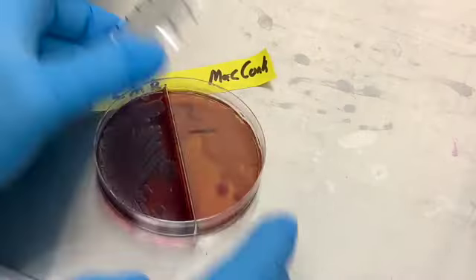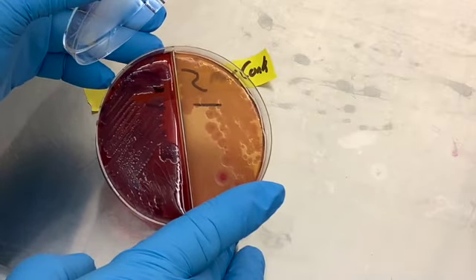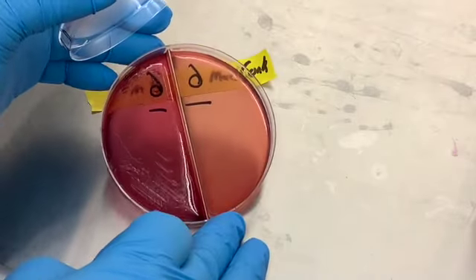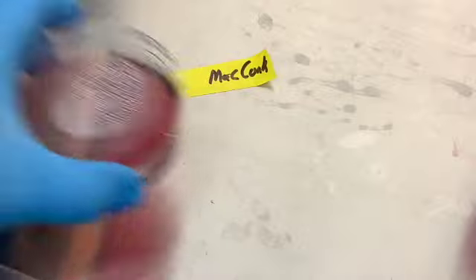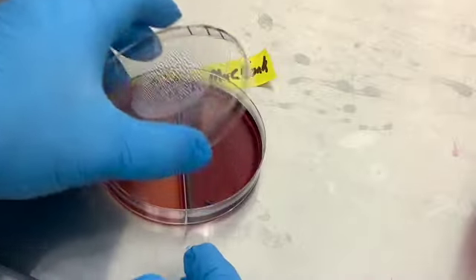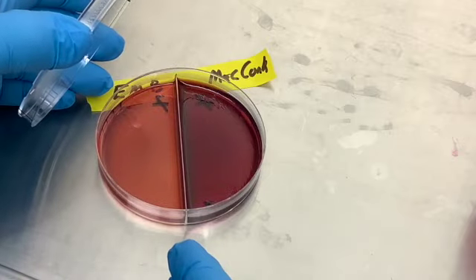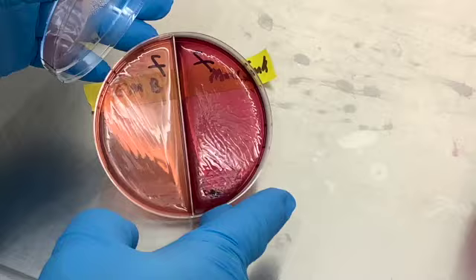Number 5. Number 6. No growth. Number 7, no growth.